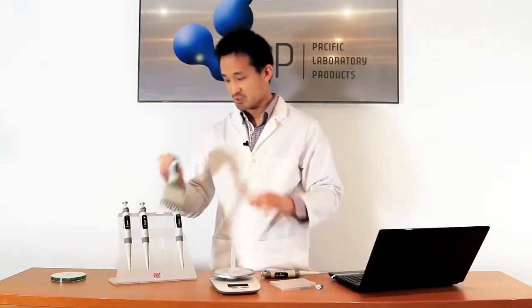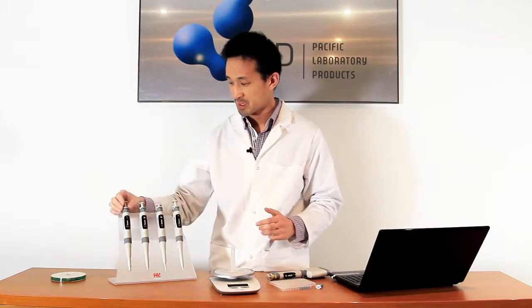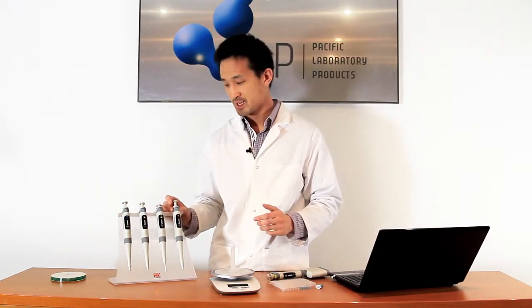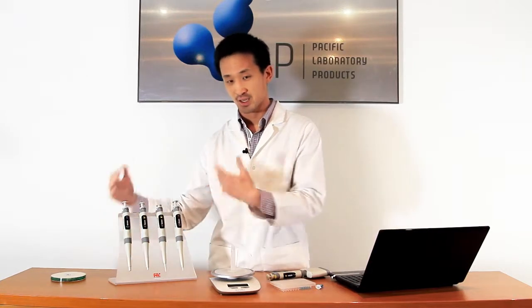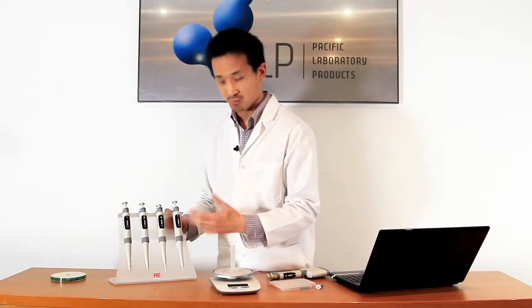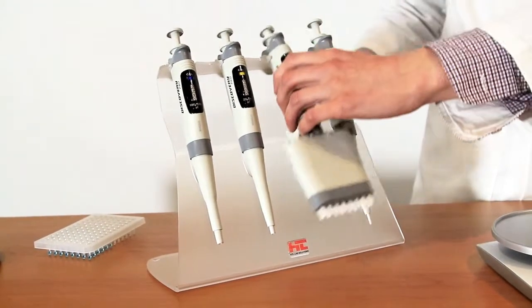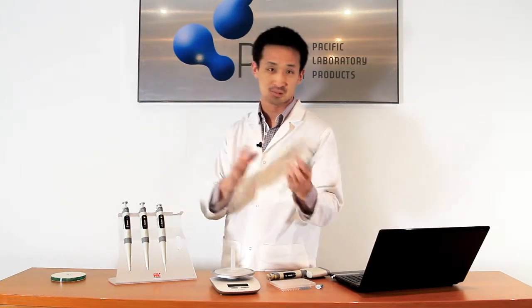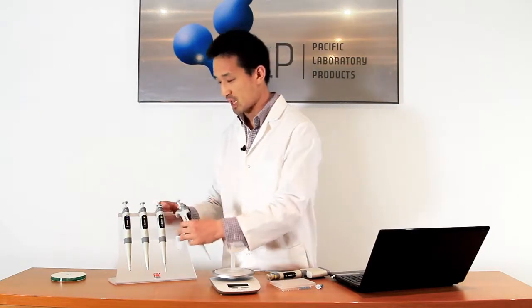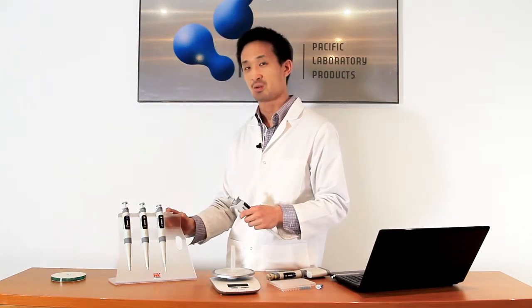The rack here is available. You can buy the kit with the P1000, P200, P20, and P10, and you get the rack as well as an entire kit just like this. The rack itself can also be bought on its own, and it's actually compatible with your current pipettes — so if you only need one or two HTLs and already have other size pipettes, you can buy the HTL rack. You just have to check the details available online.